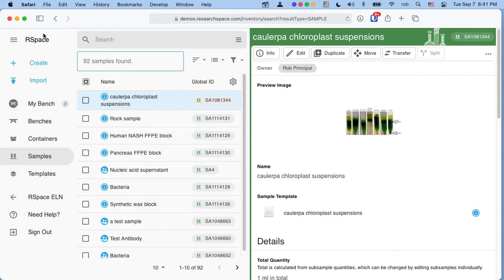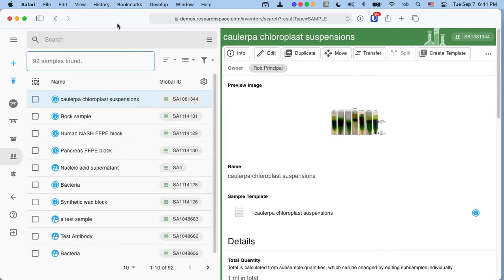The first panel, we sometimes call it just the control panel, and this one includes some major filters for letting you choose what it is you'd like to look at today. And it also lets you do things like sign out of the system or go back to the ELN or bring up the written documentation. Once you've learned all the text here, you can actually click this icon and just collapse down that text so that you can have a little bit more free space on the screen.